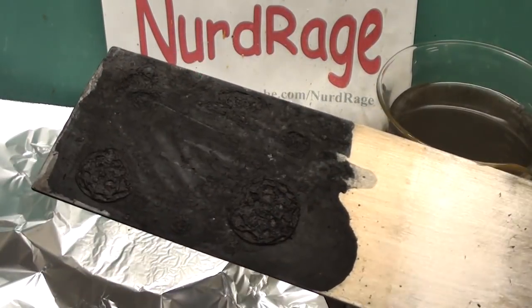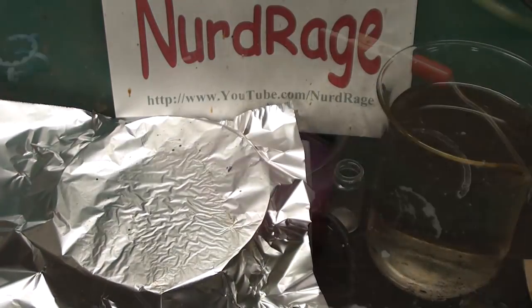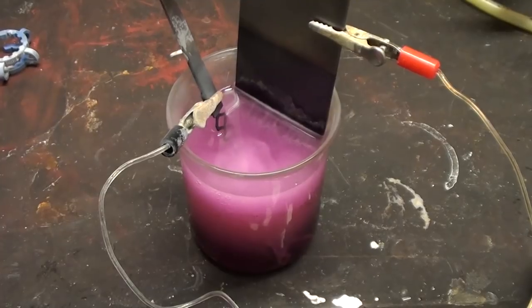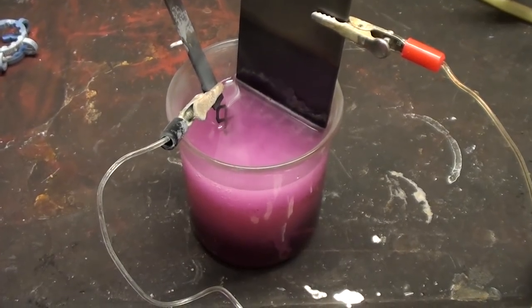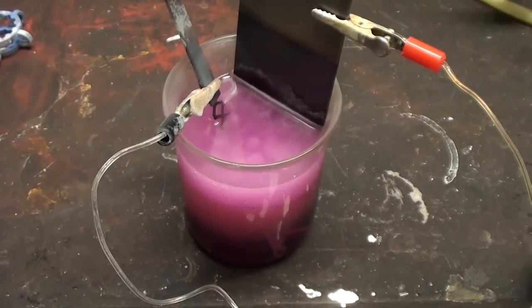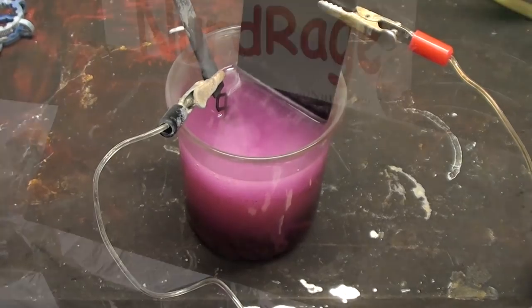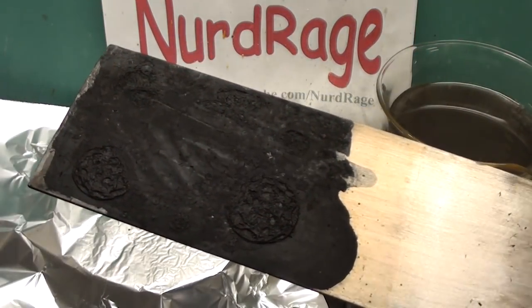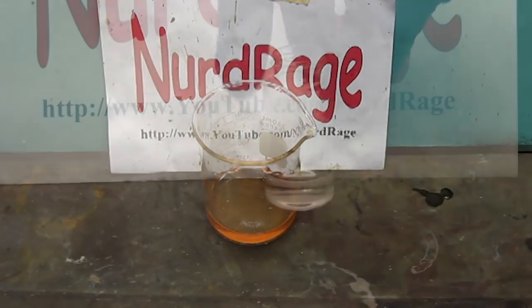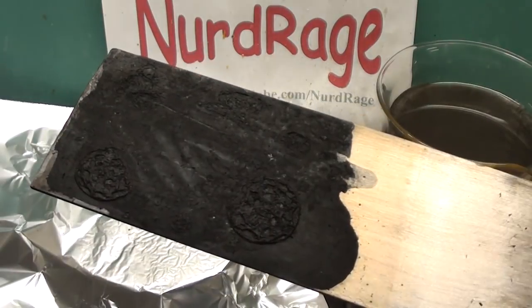Eventually you'll have a manganese dioxide on titanium electrode. This electrode can be tested by electrolyzing a weak sulfuric acid or sodium chloride solution. Unlike the impure electrode I made last time, this one passivates far slower and is quite usable as an anode. I've seen it last for weeks when used with low current density. So there you have it — I failed the first time, but through this we found purity is very important to making manganese dioxide electrodes. Special thanks to the Science Madness Discussion Board.